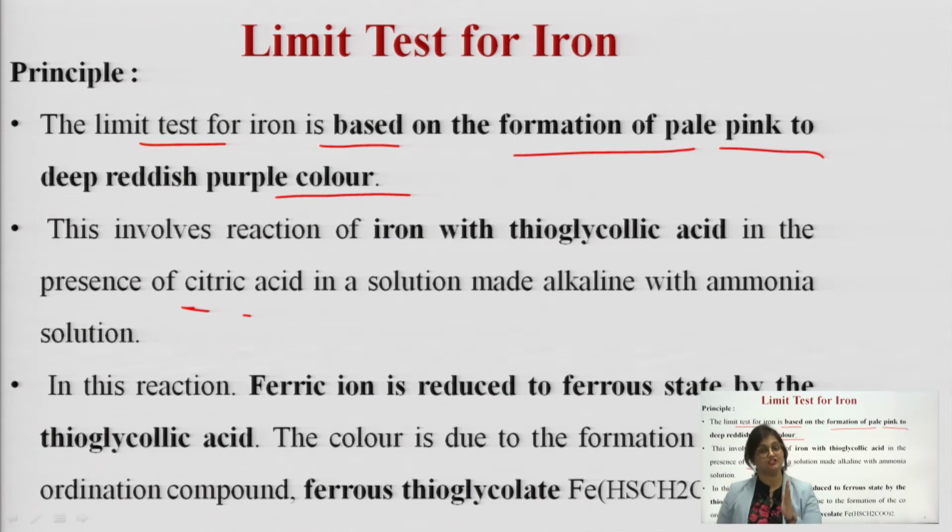When we add a reagent, if my sample contains iron, it will give a pale pink to deep reddish purple color. So, this will be our mode of identification.